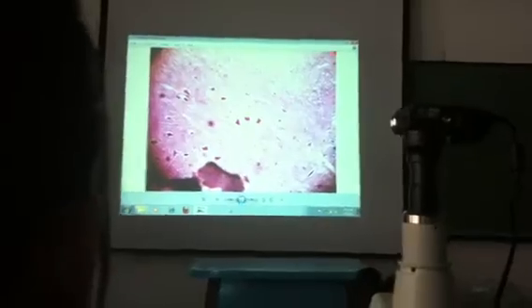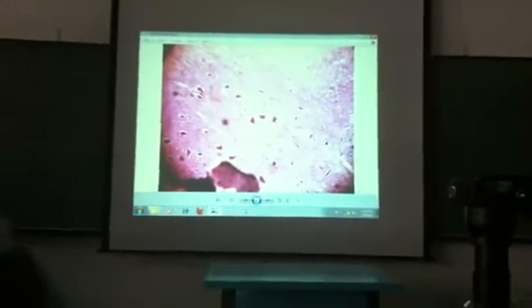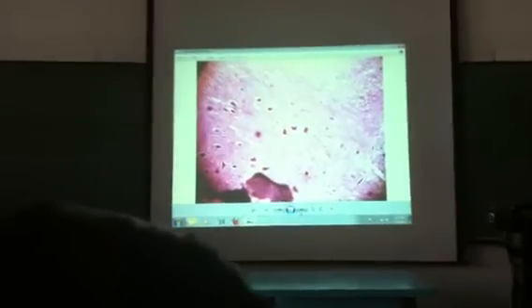Next, you have the slide on the spinal cord. Again, we are not asking you to draw the entire spinal cord. Your topic is not nervous system. Your topic is the structure of the cell. You're just wasting your time in the laboratory room drawing everything, when in fact you're going to draw again the entire spinal cord during the second cell under nervous system. So all you have to do is focus on one or two of these neurons, motor neurons.